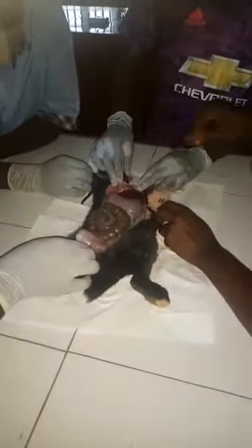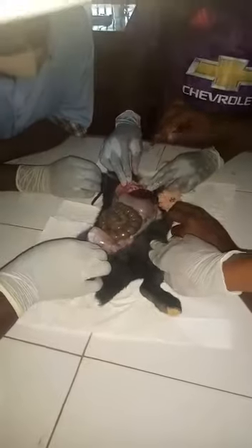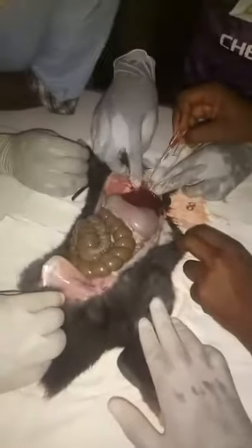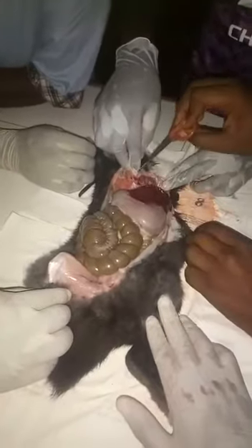All right. Let's start from the rib. Well, this is the diaphragm, right? Okay. Now look at it. This is the what? The heart. Yes, this is the heart, isn't it? Yes. Good.